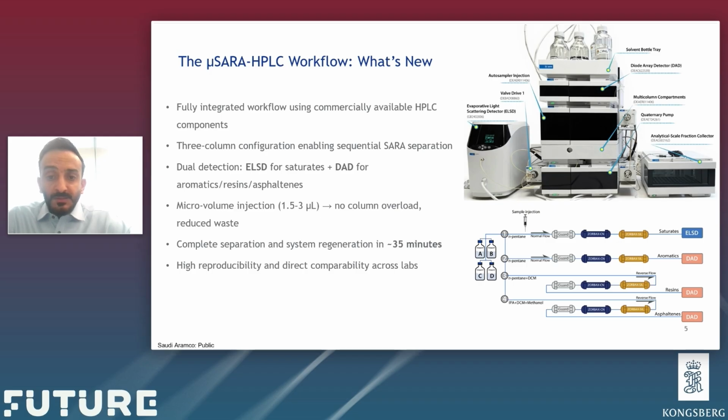The micro SARA-HPLC method utilizes a 3-column configuration that separates the SARA fractions in sequence. We also utilize a dual detection system. We have the ELSD detector for measuring the saturates, and the DAD detector to track the aromatics, resins, and asphaltenes.